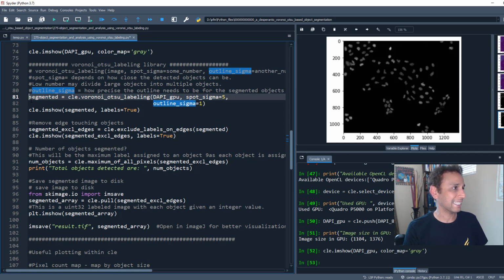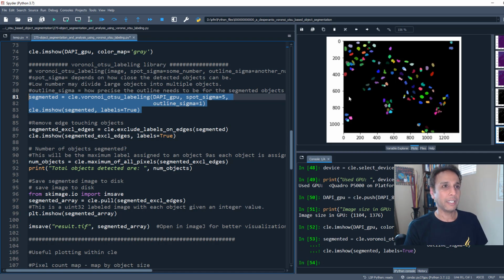Okay, so that is exactly what you probably tuned to this video. Oh my God, if I can select this. Okay, there you go. And voila, that's an amazing segmentation right there. Yeah, we did not do much. All we did was a single line right there.